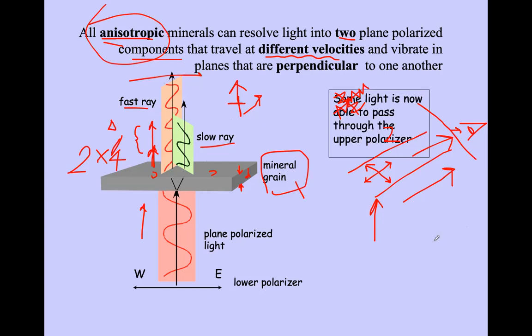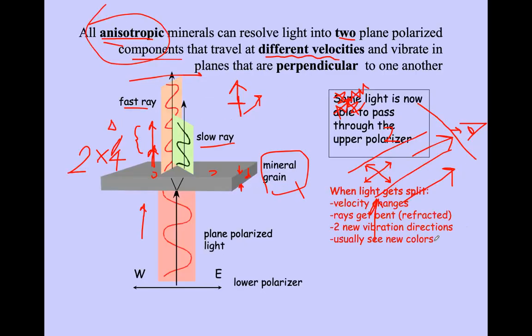So when they reach the upper polarizer, the rays will have different velocities and different frequencies, and then as they enter the upper polarizer they give out different colors. That's why we saw vivid colors when it enters there. Okay, so that's why we see new colors. Actually, it is not the real color of this mineral. That's why I mentioned it's a new, artificial kind of color. It's like a rainbow color, just because of this splitting.